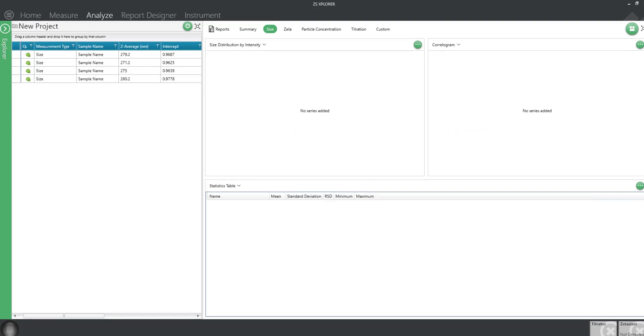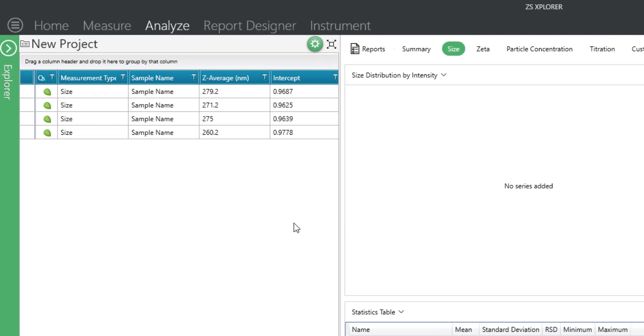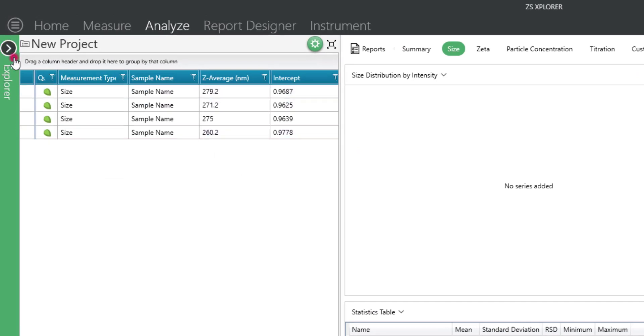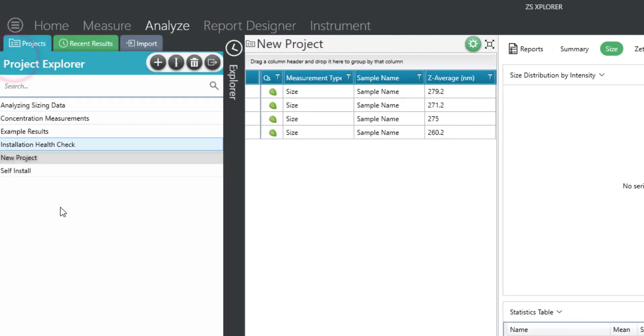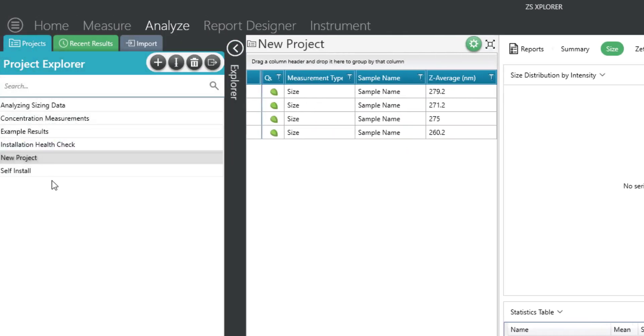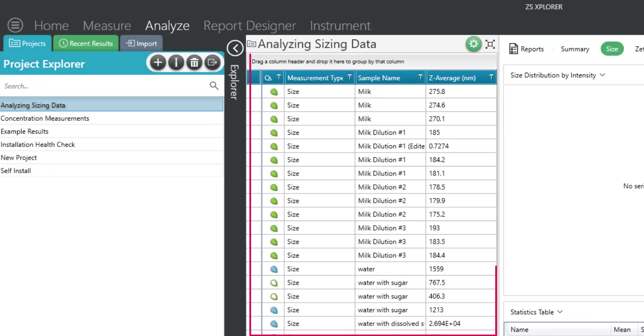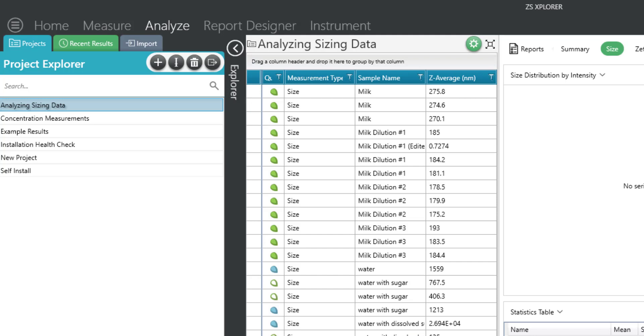From the Analyze tab, locate the Project Explorer. Select your project and you will see the record view update with the data entries located in the project. You can export the entire project by clicking the export button. You will then be prompted for the location for saving the .zmes file.